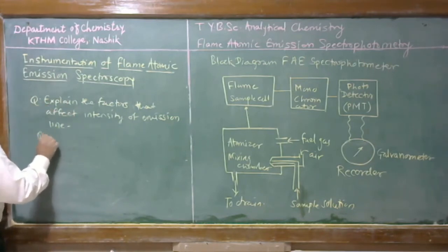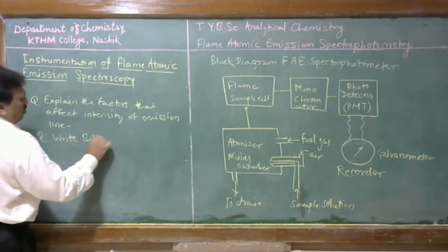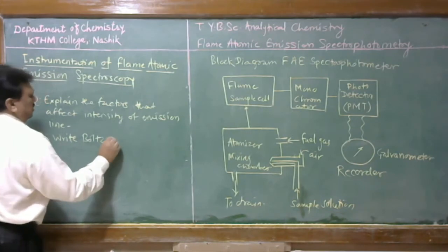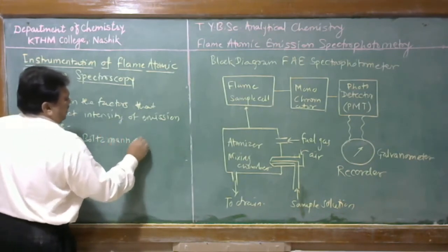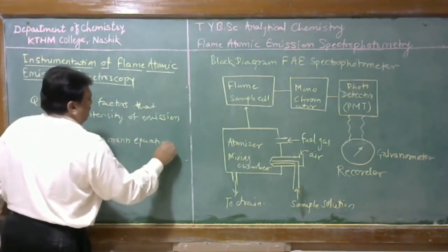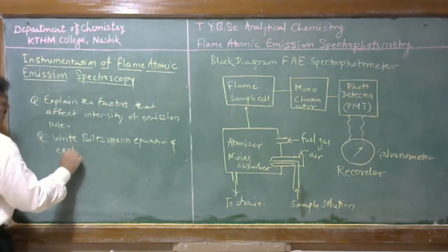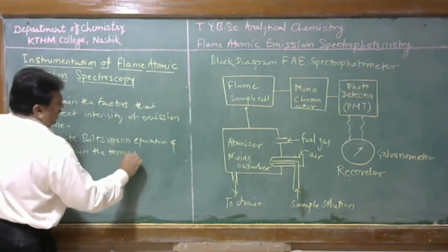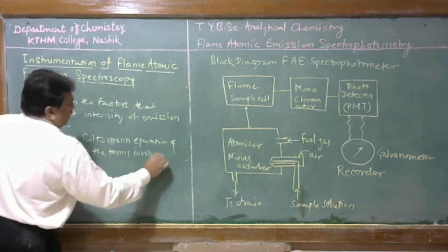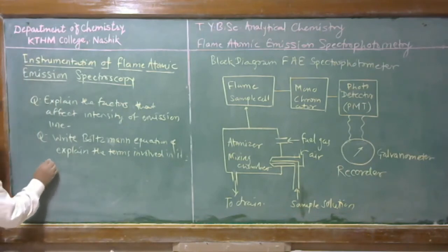Second question, write Boltzmann's equation and explain the terms involved in it. Next, draw the block diagram.